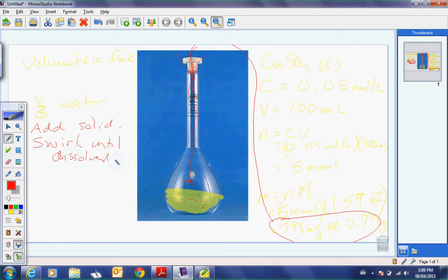Why don't we put the cap on and mix it like crazy? What would happen? Those of you that have taken your cap off by now, have a look at your volume now. Is it where it was before? Is your meniscus at the bottom where it was supposed to be exactly like it was? Exactly the same? Most people's won't be. Why? What happened?